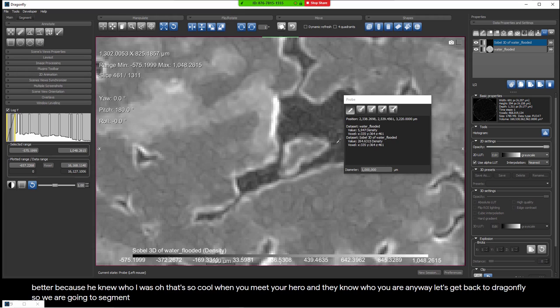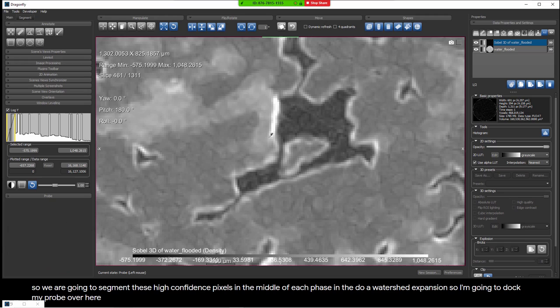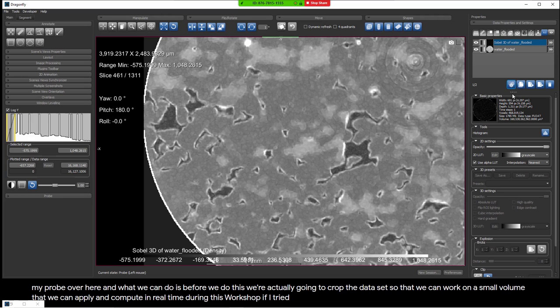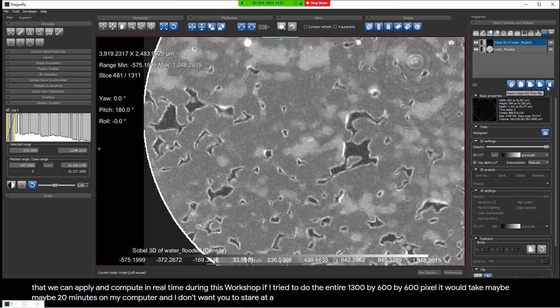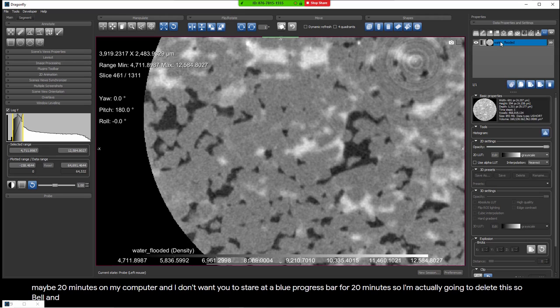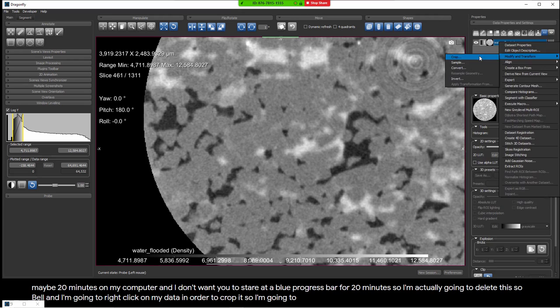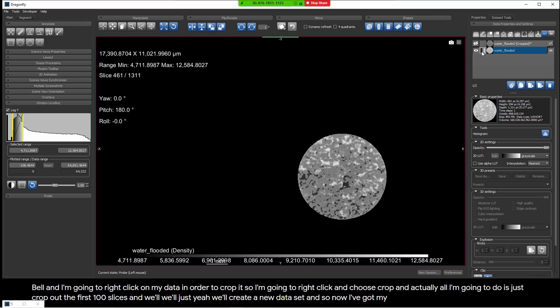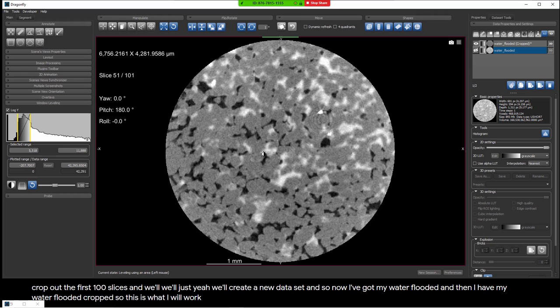We're going to segment the high-confidence pixels in the middle of each phase and then do a watershed expansion. Before we do this, we'll crop the dataset so we can work on a small volume and compute in real time during this workshop. If I tried to do the entire 1300 by 600 by 600 pixel volume, it would take maybe 20 minutes. So I'll right-click on the data, choose crop, and just crop out the first 100 slices to create a new dataset. Now let's go to Tools > Segment > Histographic Segmentation.